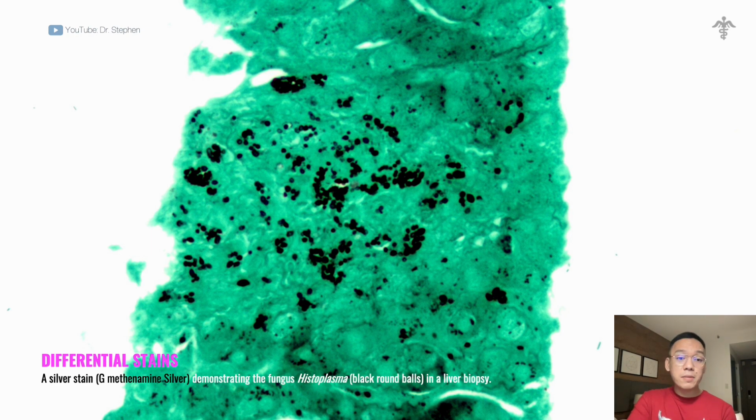Although other organisms in this examination, let's say for example bacteria, can also be detected, silver staining requires skill. With that, non-specific staining can render slides that are incapable of being interpreted. So it could also give us some characteristics or visible colonies of your bacteria.